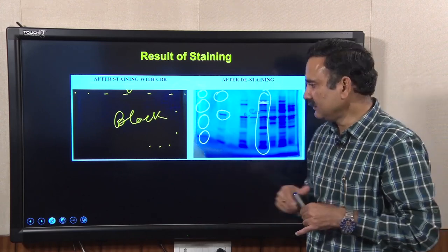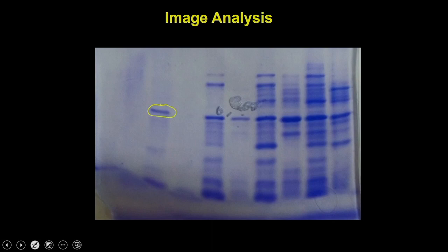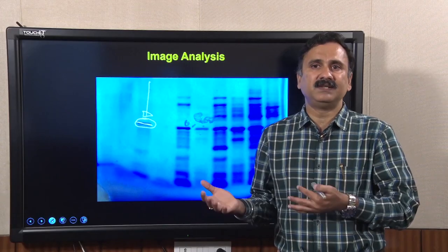the lane. Now once you have got this image, you can analyze two things: one is the position of the band, the second is the distance from the origin. Apart from that, you can also see the intensity of this particular band. So these are the three pieces of information you can infer when you do the image analysis after the staining procedures.